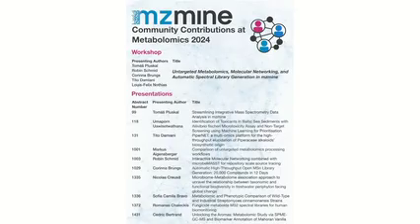And with this is the end of my presentation. I just wanted to highlight that you can see how popular MZmine is from the number of abstracts at this conference that actually mention MZmine, not to mention this workshop, of course.